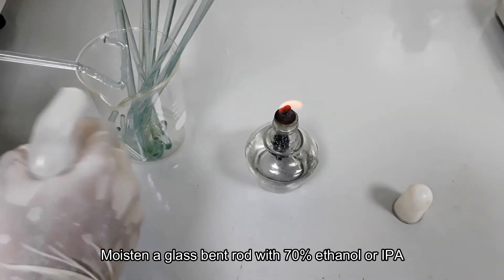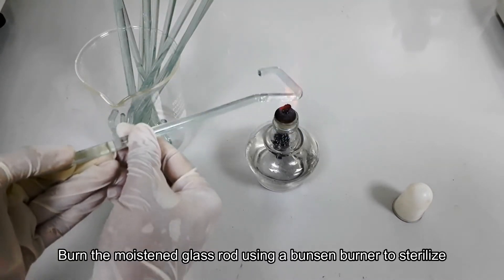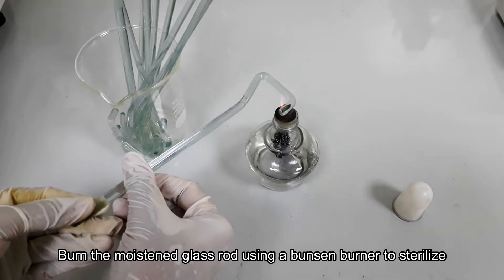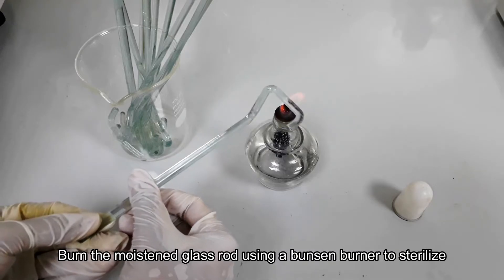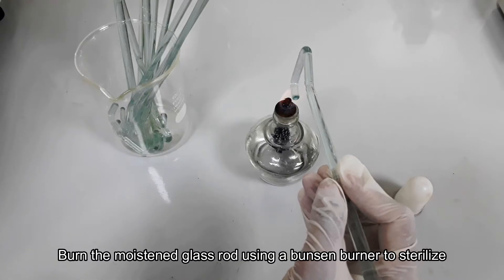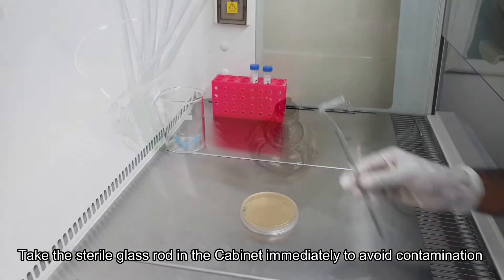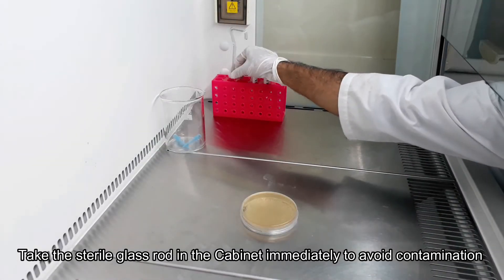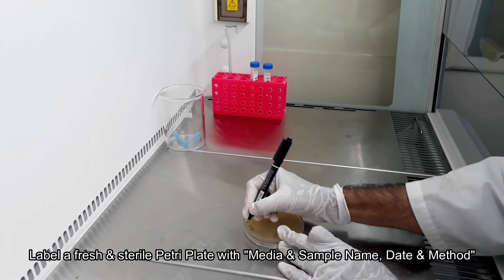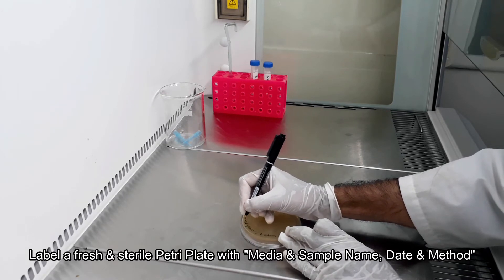First of all, wet a glass spreader by spraying 70% ethanol or isopropyl alcohol and burn it by rotating for sterilization. After that, keep it inside the biological safety cabinet and wait to cool. Label a fresh culture media plate — labeling should include media name, test name, method, date, etc.